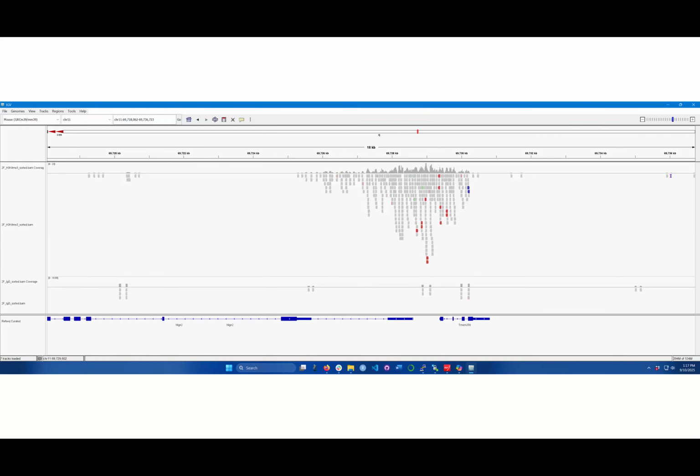Yeah, I should have put maybe an explicit slide about that. So, usually people will use H3K4 trimethylation as a positive control. It's helpful at every step if you're doing ChIP-seq, CUT&RUN, or CUT&Tag, because when you measure DNA, you should get some DNA from H3K4 trimethyl because the antibody is very good. So that helps you to know that it worked before you do the actual sequencing. It also is very highly localized to those promoters. So it gives you these clean peaks like we're showing.